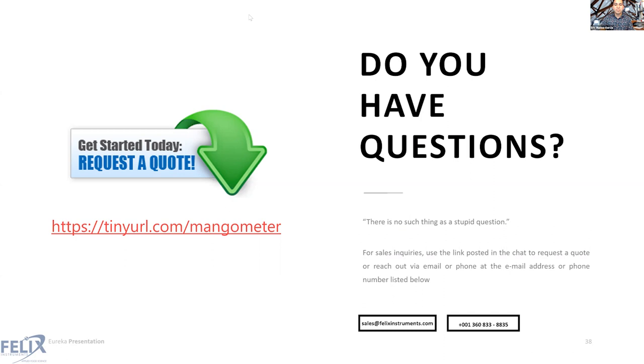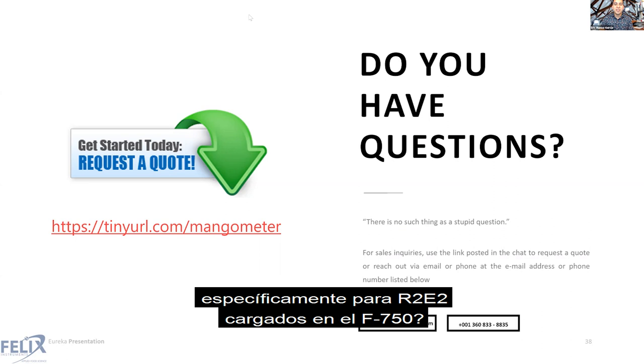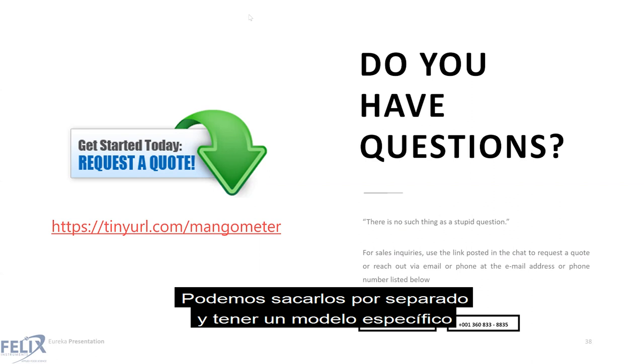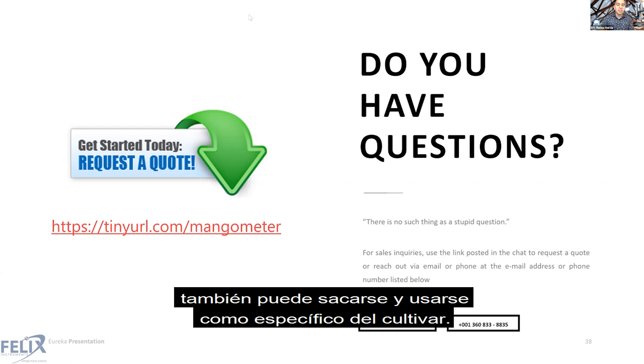Lauren Smith asks, Carrie, can we get a mango model specifically for R2E2 loaded onto the F750? Yes, same as the Kensington Pride one. We have R2E2 in that master model. We could pull those out separately and have a cultivar-specific model. That's doable. So, yes, it is included in the current model, but it also can be pulled out and used as a cultivar-specific one. Thank you, Dr. Walsh.